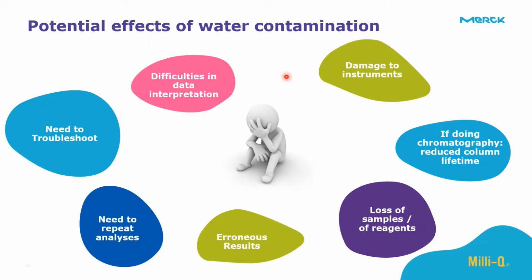So these are the effects of water contamination. Of course, the very first one and the glaring one is the erroneous results. You're not able to get accurate and reliable results. The desired results, you'll not get them if you have contamination in water. Of course, when you have erroneous results, you will need to repeat the analysis. And when you repeat the analysis, you lose on time, you lose on money because you're using extra reagents. And of course, there is loss of business in case it's a testing lab, and there is a lot of downtime when it comes to repeating analysis.